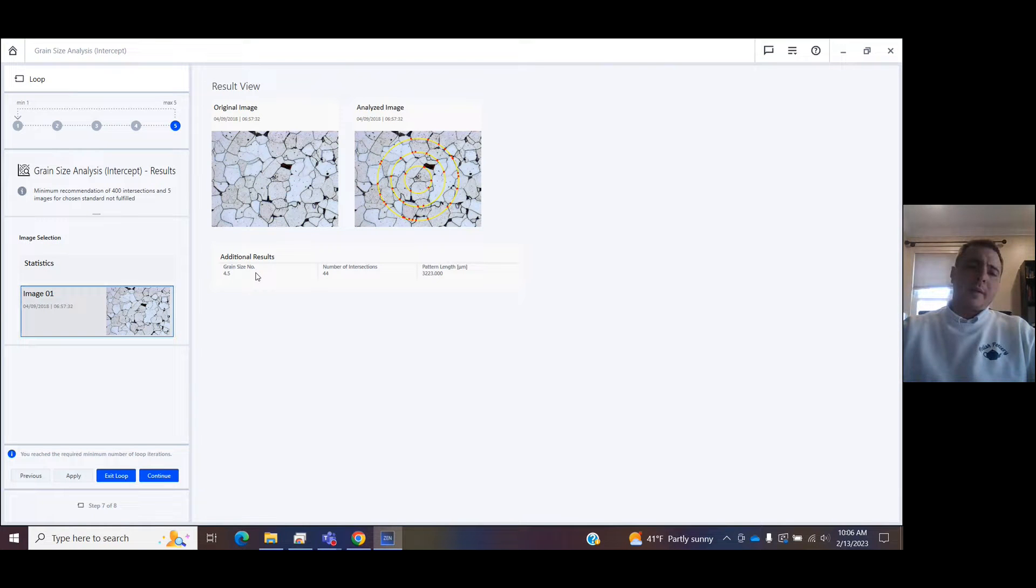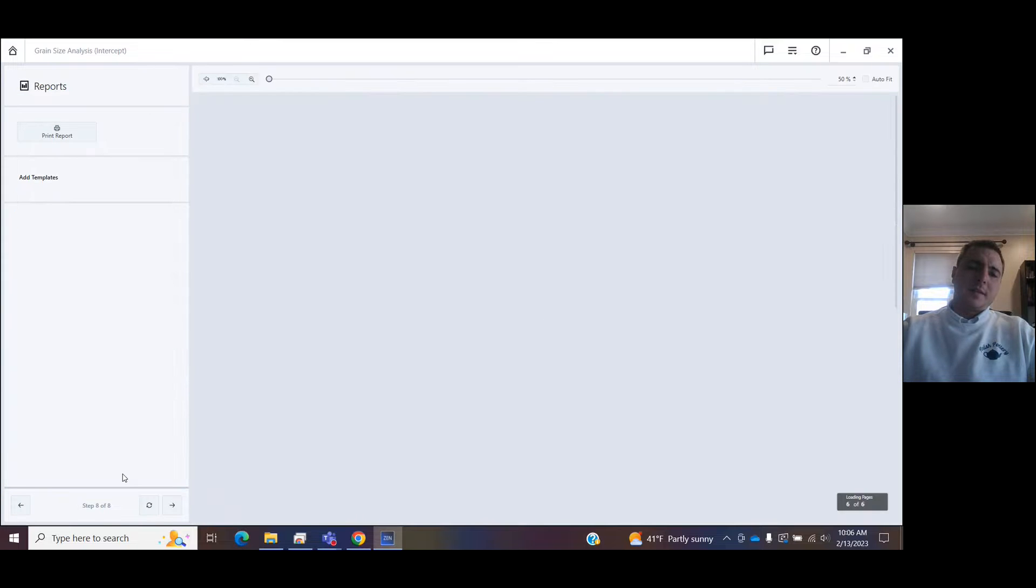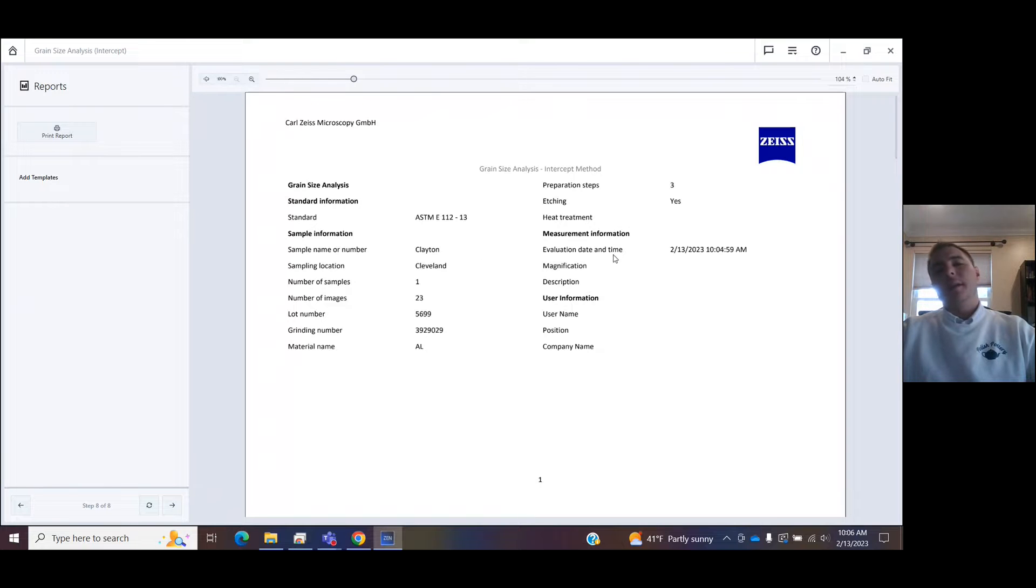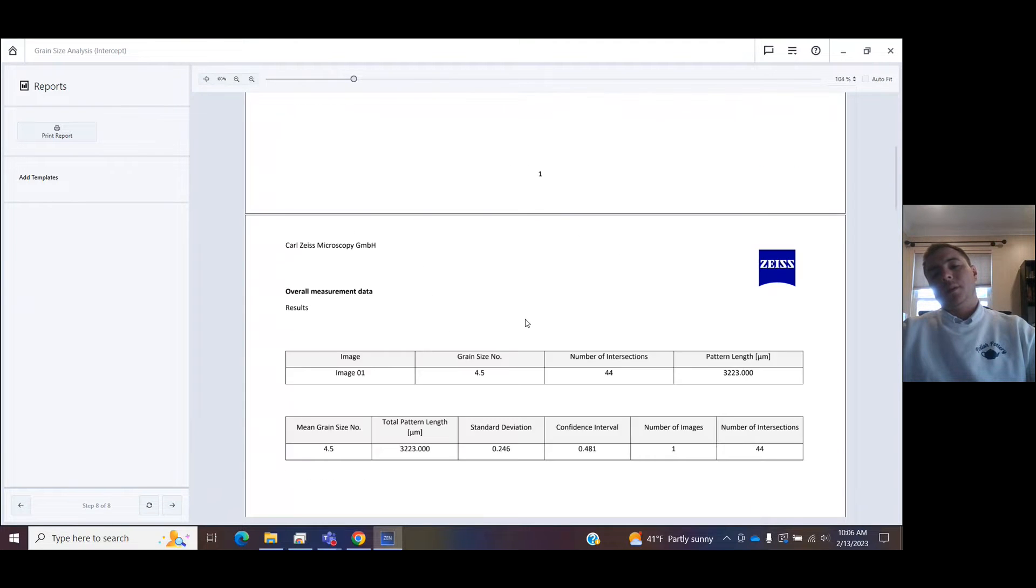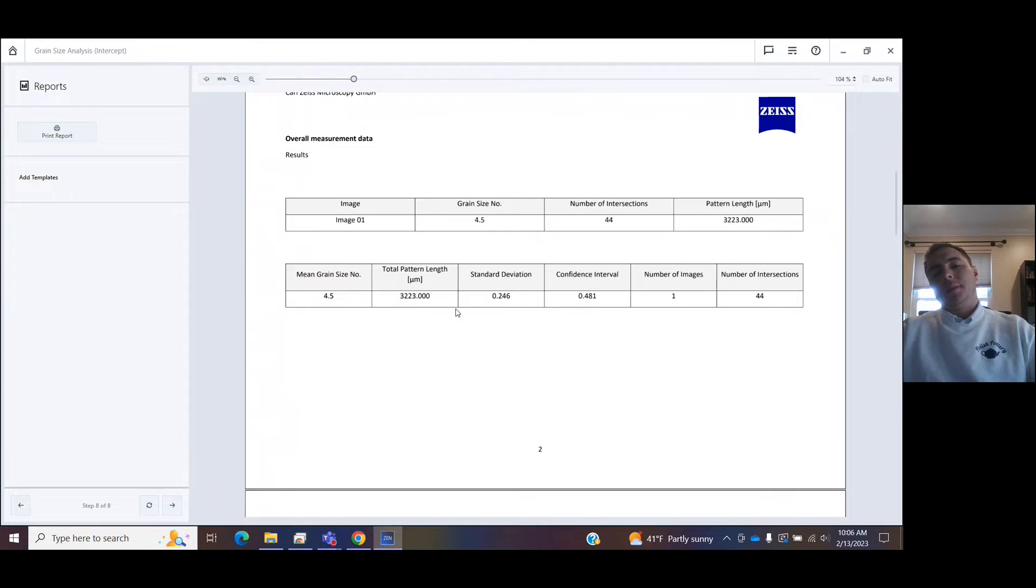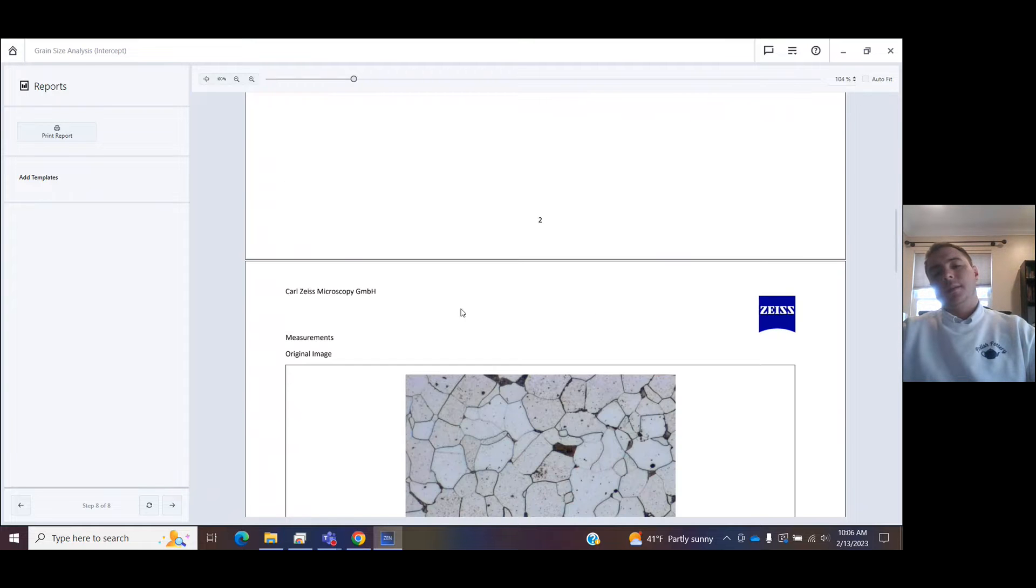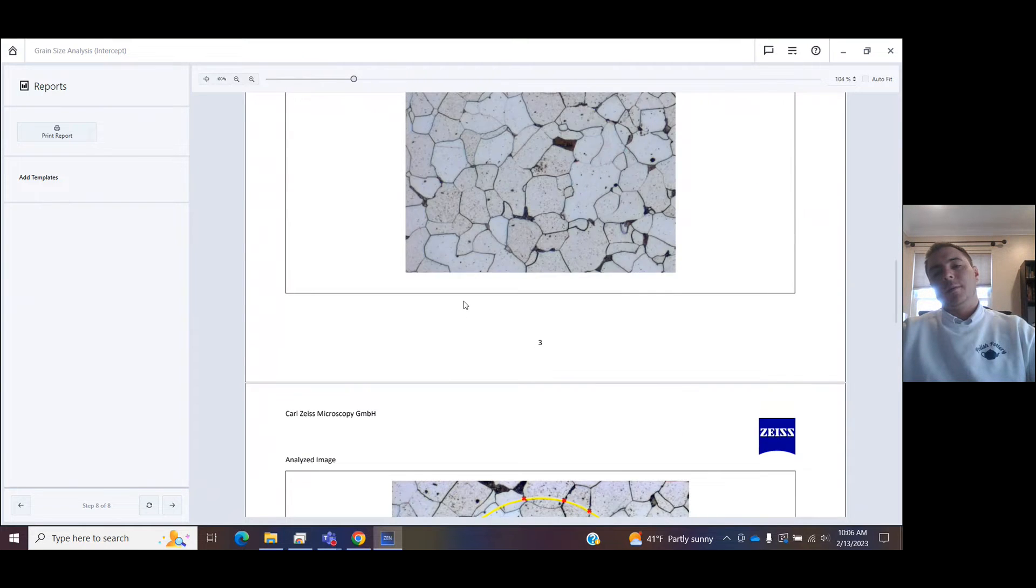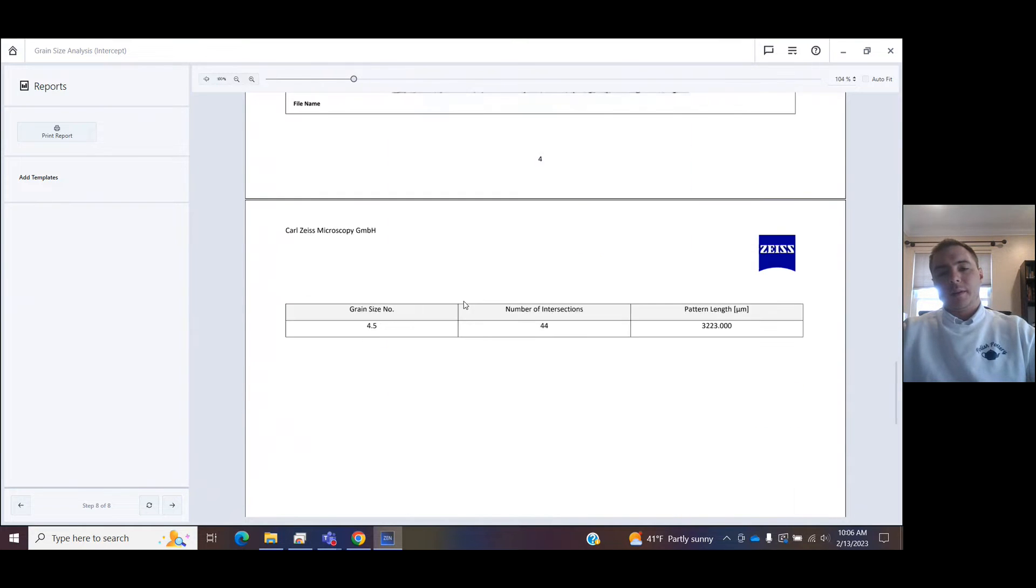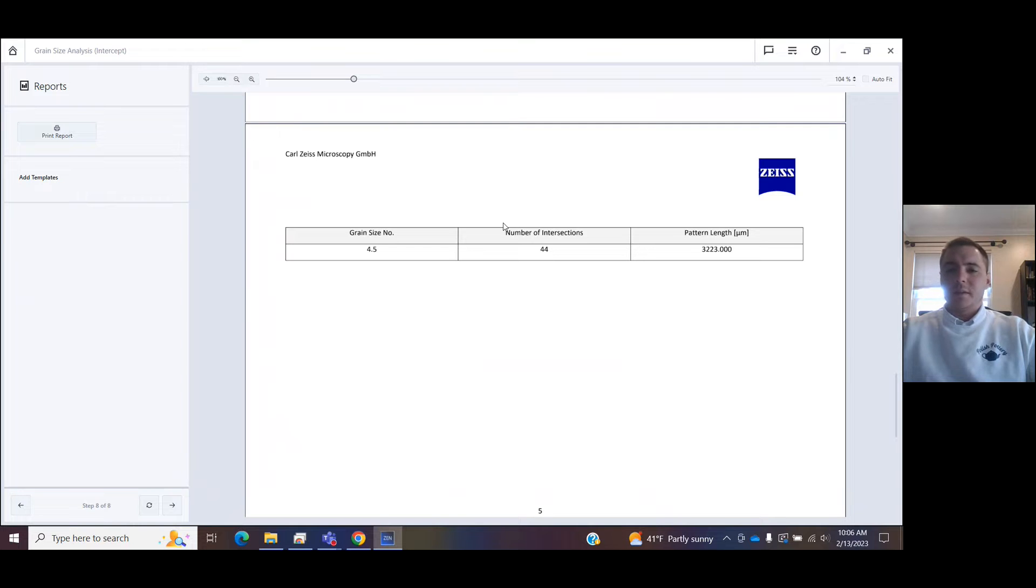It will shoot out the grain size number for you, the number of intersections. If I exit the loop, it's going to come up with this report where all those steps I did at the beginning, that data entry is stored. You have your math and statistics, your original image, then the image with the intersections, and the final results that you can save as a PDF.